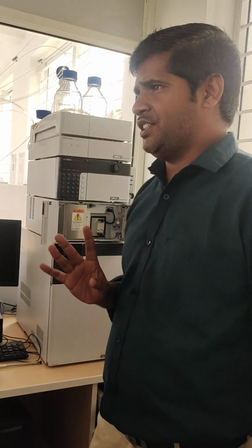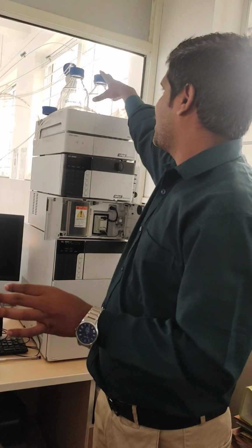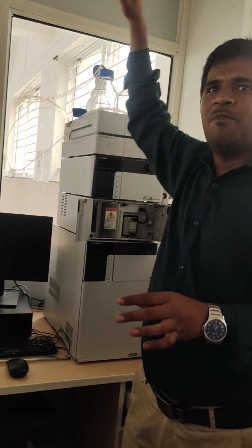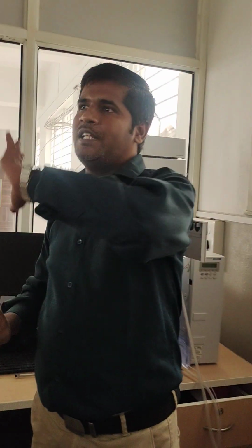How do we optimize the system? Simply, we don't know which solvent we have to use, so we add acetonitrile in bottle A, methanol in bottle B, water in bottle C, and 6.8 buffer in bottle D, because we have to check where we get the retention time in the minimum time.